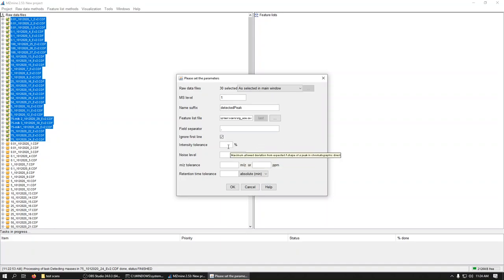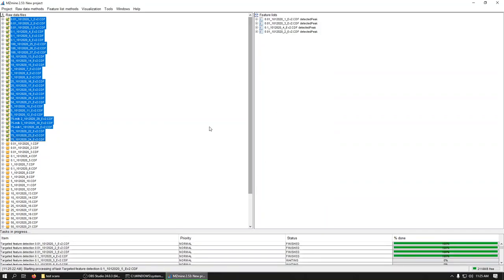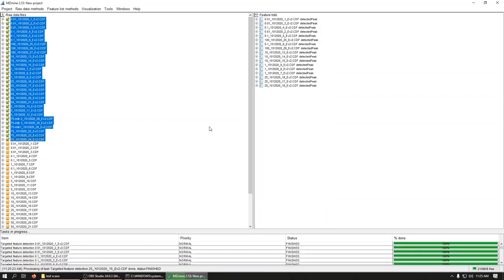And now we need to give it some tolerance. And again, we've got really clean data. So we can just kind of pick at it. Intensity tolerance 5%. Noise level at 1 again. Now you can't set the tolerances at 0. Because then it won't detect. So mass charge tolerance of 0, or not 0, of 1 absolute unit or 5 parts per million. And we'll set our retention time tolerance at 1. Actually, that's a really broad window. So we'll go to 0.5. And we'll say OK.